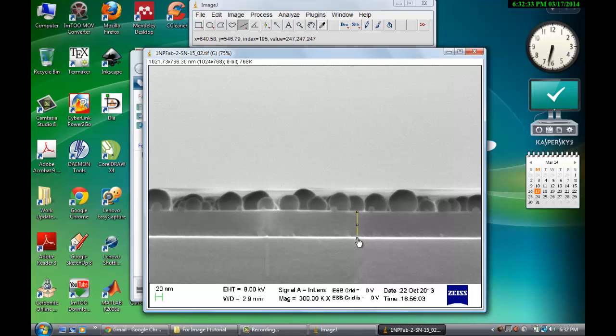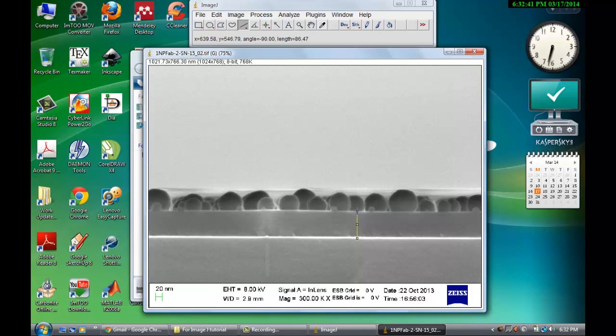It shows that around 86 nanometer, the length. See the ImageJ interface.